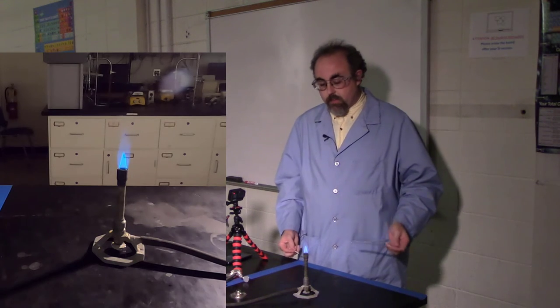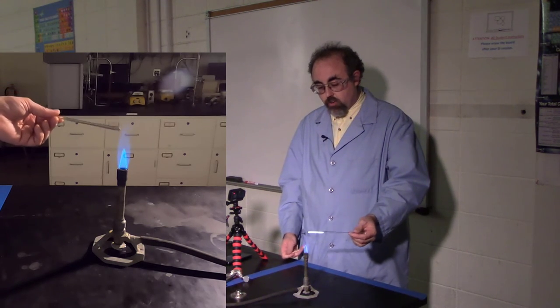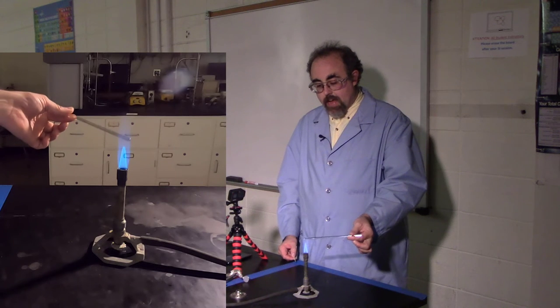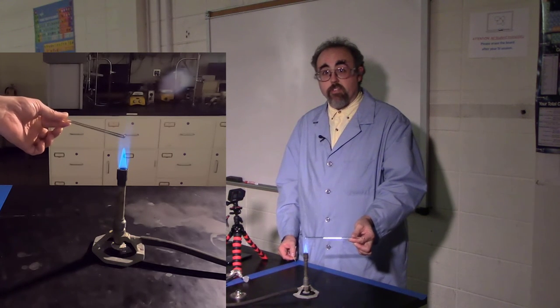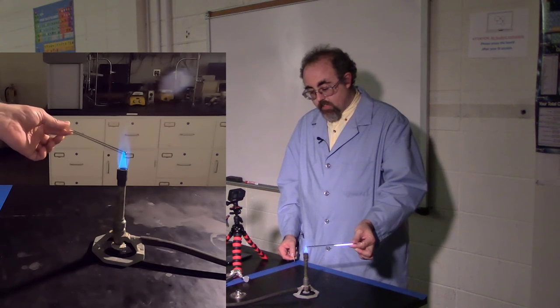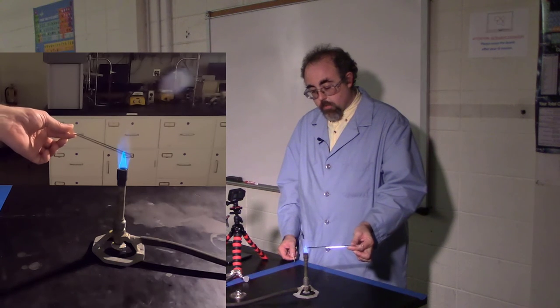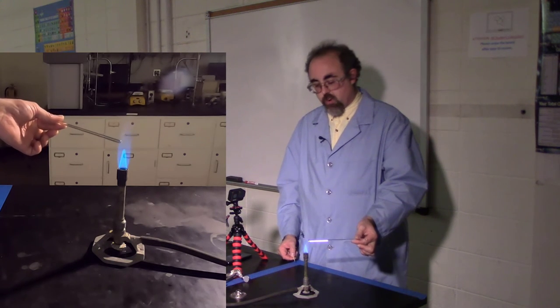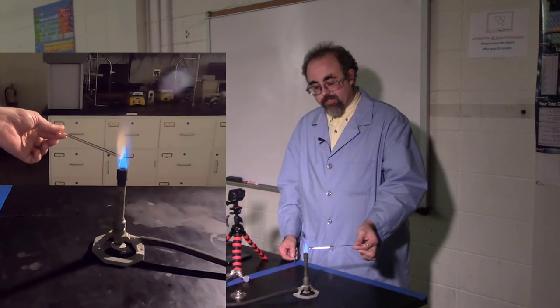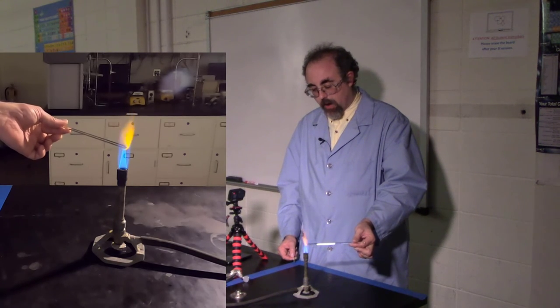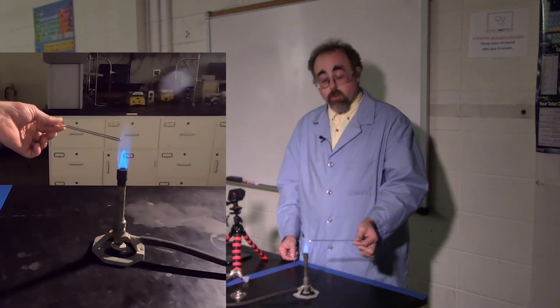You'll notice when you have your flame, you have typically two flames, and this is usually where you want to get it to. You have an outer flame, which we call the cool flame. Now, it is a flame, so it is not cool. And then you have the inner flame, which is a warmer flame. You'll also notice my glass stirring rod. This is a soda lime glass. The sodium is causing the interesting color here, which that will be for another video.